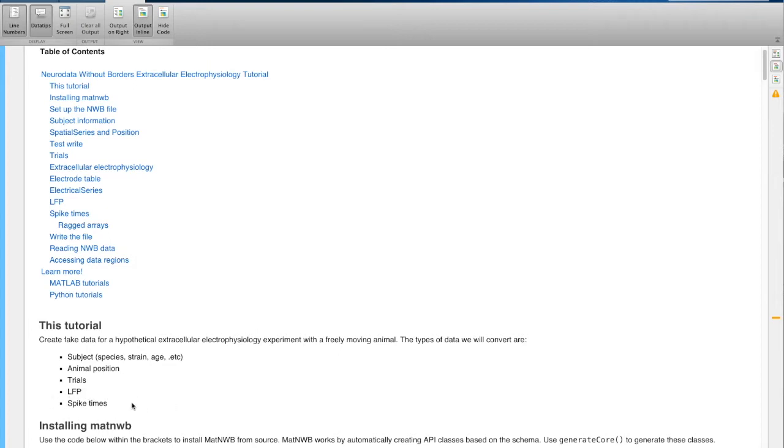during the experiment. I know that a lot of you are going to use these types, but also a lot of you are going to need additional types. We're just going through these basics here, but I assure you NWB has lots of different data types, and I will direct you at the end towards documentation you can use to find the data types that would be relevant for your specific use case.